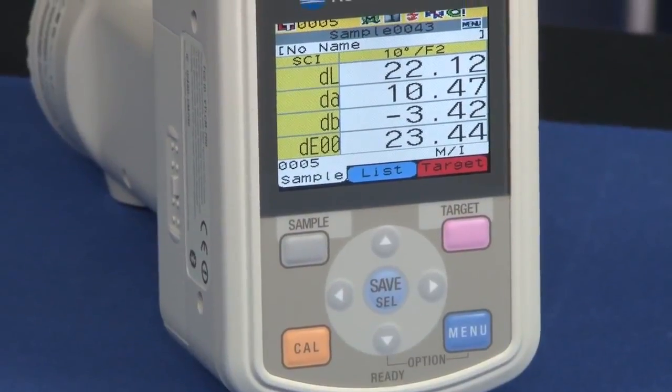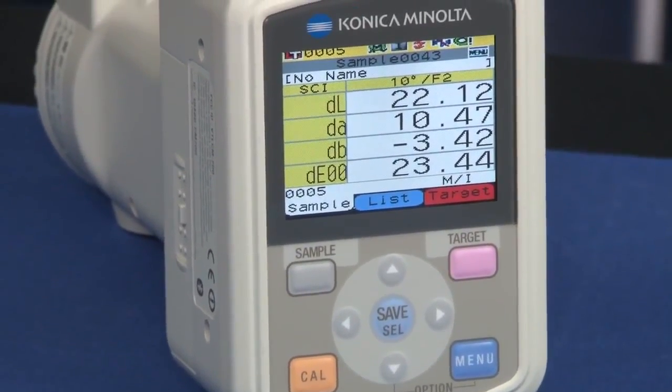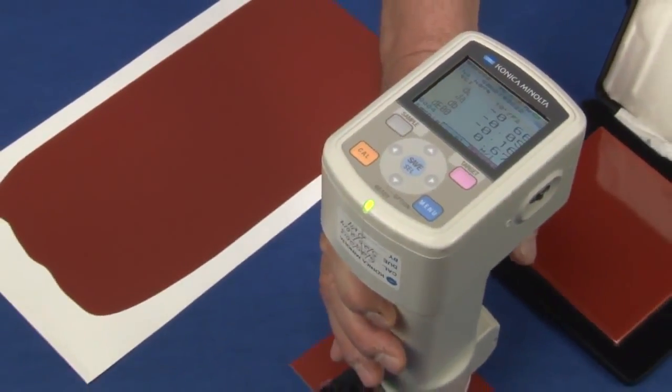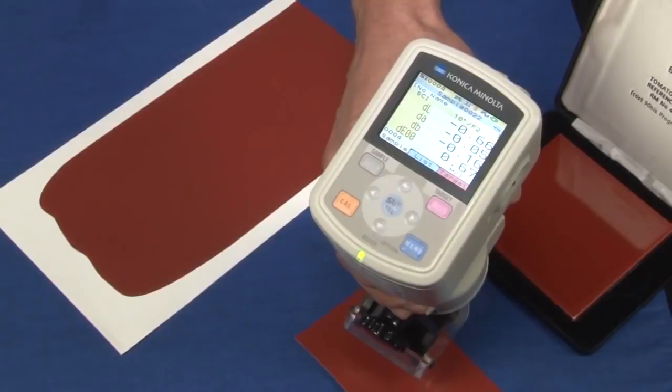Dedicated buttons for frequently used operations make it easy to call up menus or target colors. The menu-driven display allows anyone to operate the instrument intuitively.